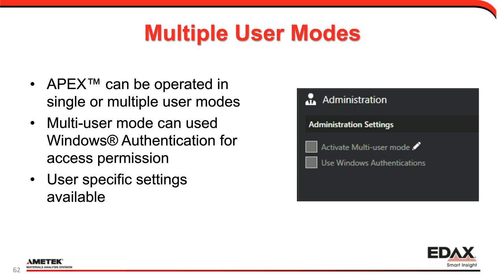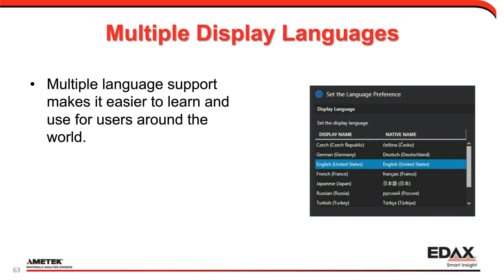And then thinking that we have users around the world, we also provide multiple language support. So if you want your buttons to have French or Chinese or German text, those are available as different languages.